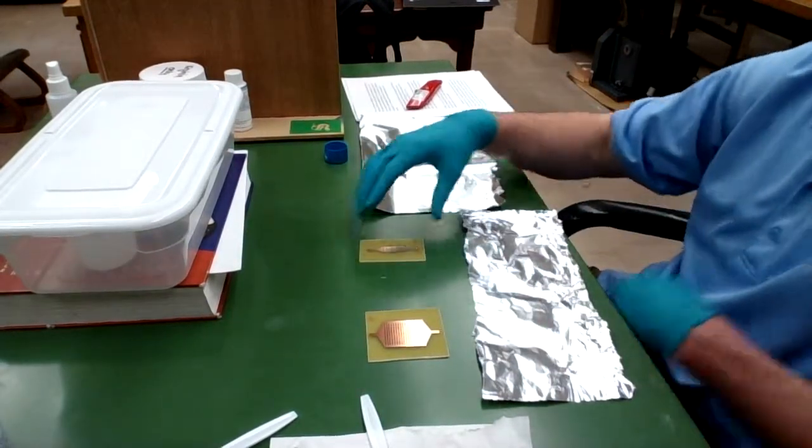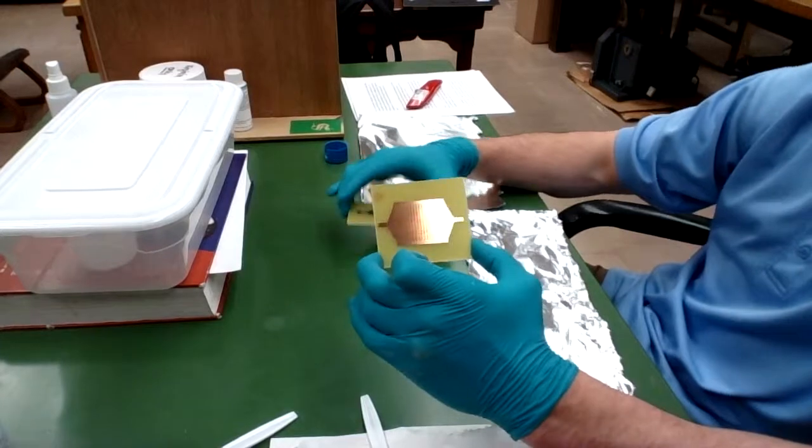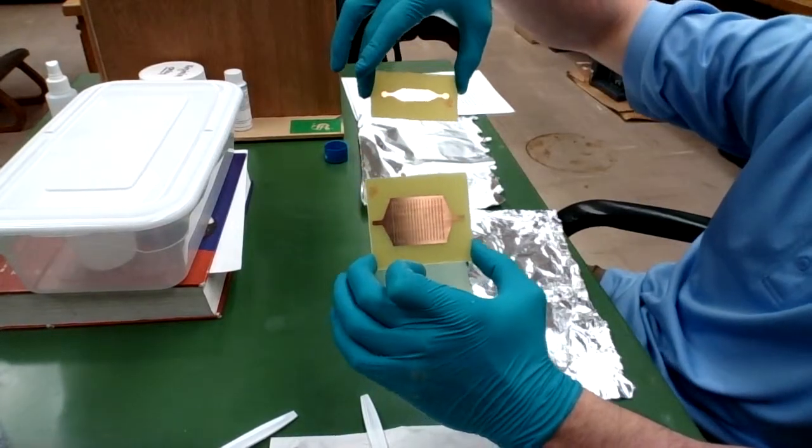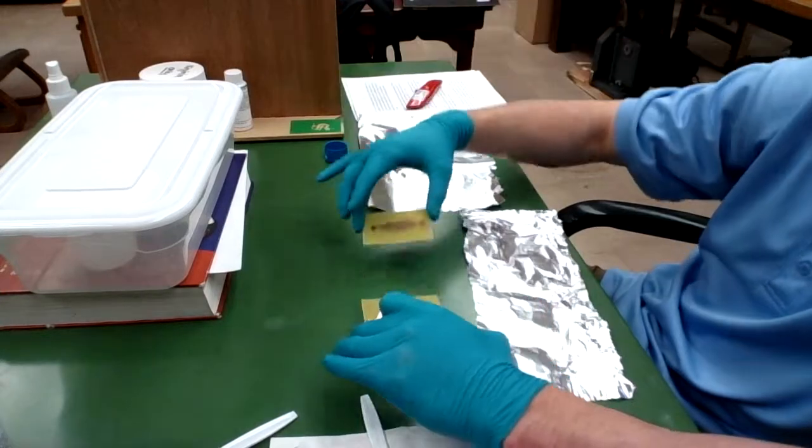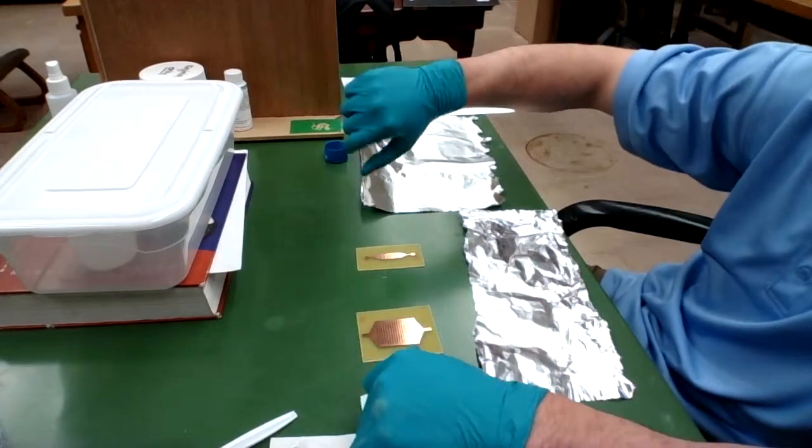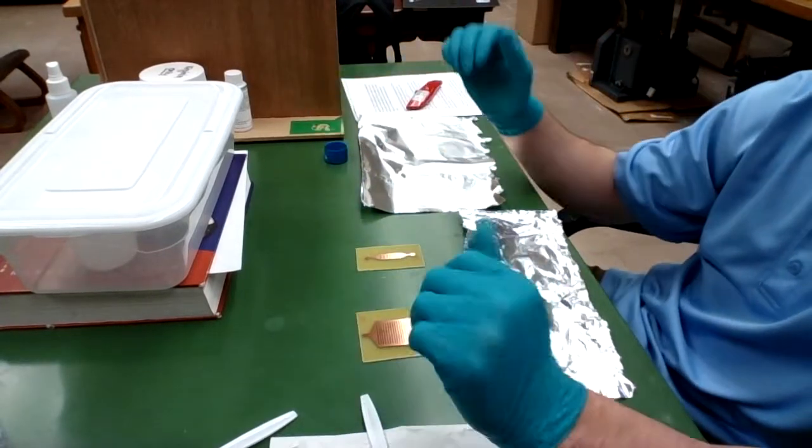Alright, so while my PDMS is degassing, I'm going to take my two PCB designs and create vessels for them out of aluminum foil so that I can pour my PDMS into them and allow them to cure in the oven.